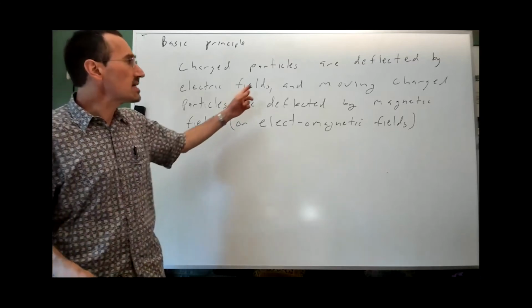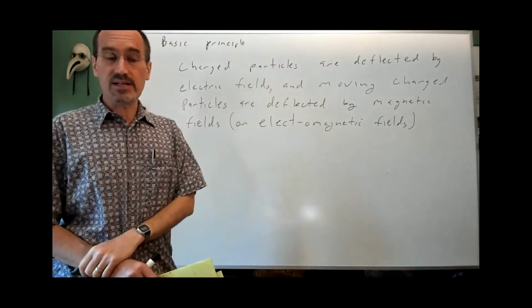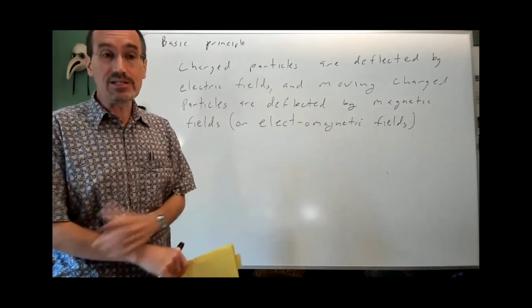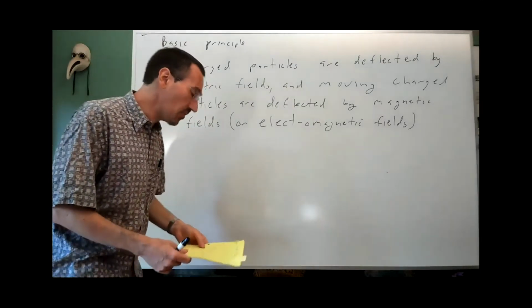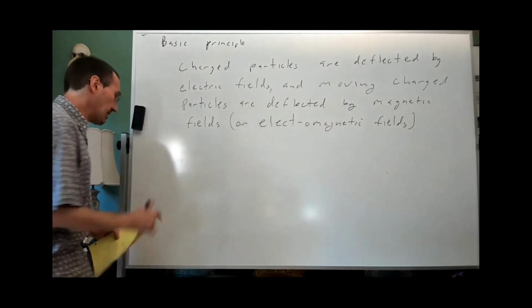We also need to get it moving, and we need to get it moving in the gas phase, which in the case of big molecules means you have to get them into the gas phase, and I'll talk more about that in a moment. Now, there's also another principle.